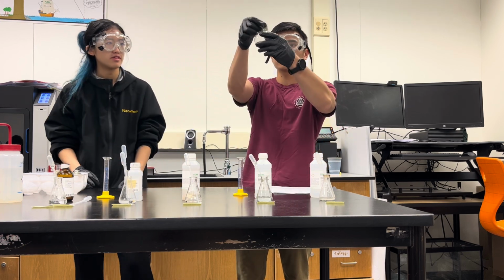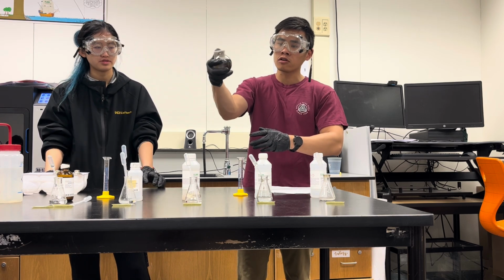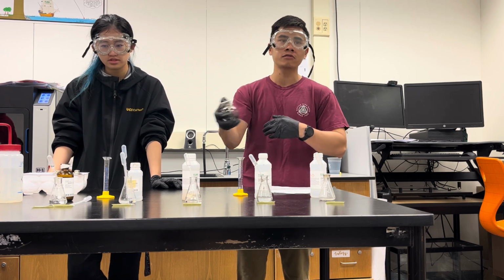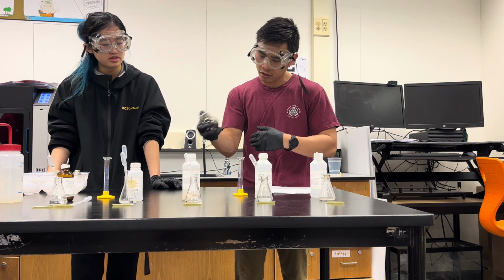And this last part, you should see it turn brown. I'm gonna cap it, and I'm gonna swirl. And the important part is to make sure that I'm capping it. If I'm not capping it, all of that's ending up on you, and it does stain your clothes. So you're just gonna keep on swirling.